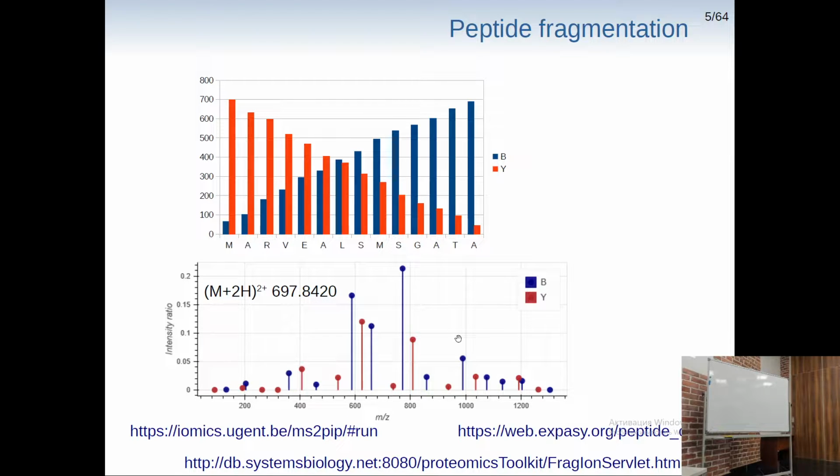So, in real mass spectrometry data, we will have something like this, which sometimes will be enough for de novo sequencing, but most of the time some part of your peptide will not be seen in this mass spectrum, and you will have to use some other approaches. What can be done if you still want to get the sequence of your peptide? What do you think?